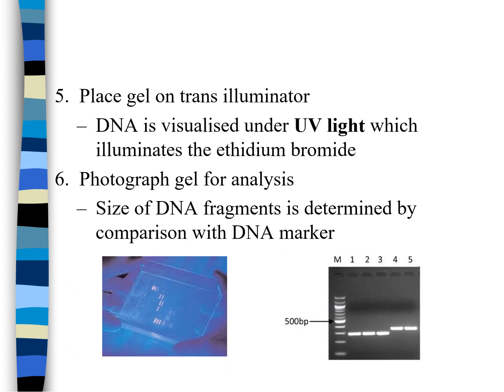Okay, so in this slide, the important thing here is that we're using UV light. Remember, we've added ethidium bromide, so ethidium bromide is stuck to the DNA. So if we shine UV light, we will be able to see the DNA bands. So here we have shown UV light on our gel. Okay, and then we took a picture, so you can see here the DNA samples. So this is, let's say, patient 1, patient 2, patient 4 or 5. We have different size bands.